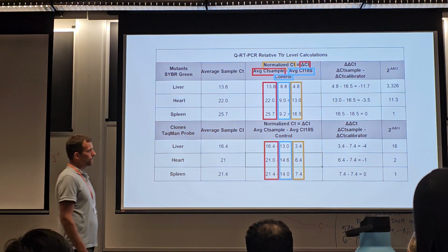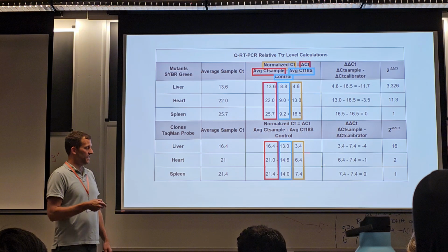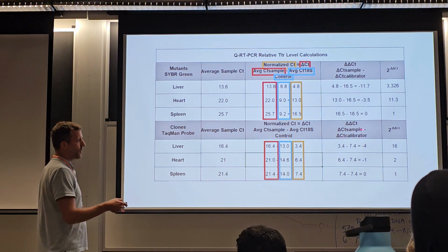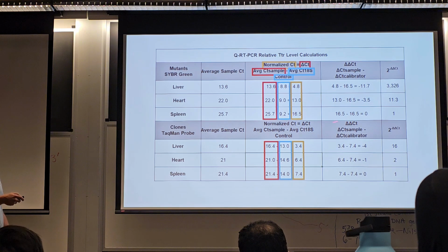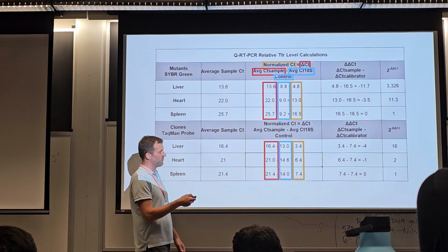Okay. The next thing we're going to do is pick one of these as our calibrator. I always confuse the language on this. The proper way to say what we're going to pick next is the calibrator. I talk about this as calibrating because we're normalizing, right? But what we normally call the next one, or what we pick next, is our calibrator. So I'm sorry if I say the same words in the wrong places.